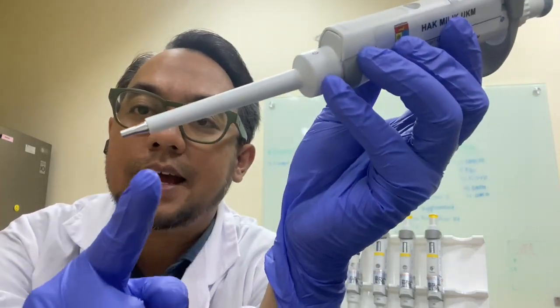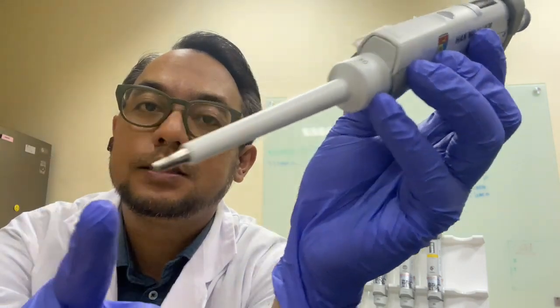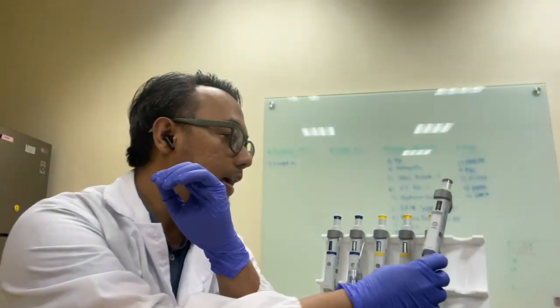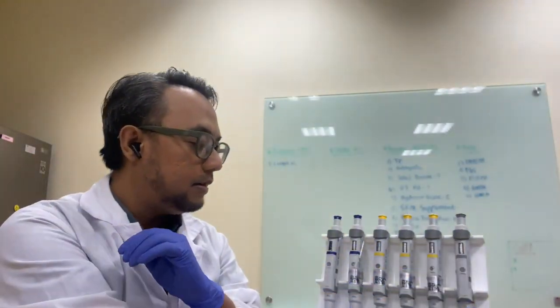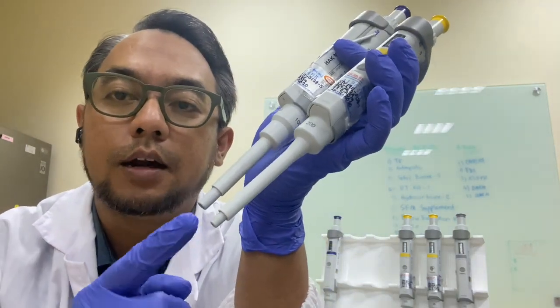So, the 10 microliter pipette has different edge. This one is made from steel. But the rest, you can see, the rest is made out of plastics.